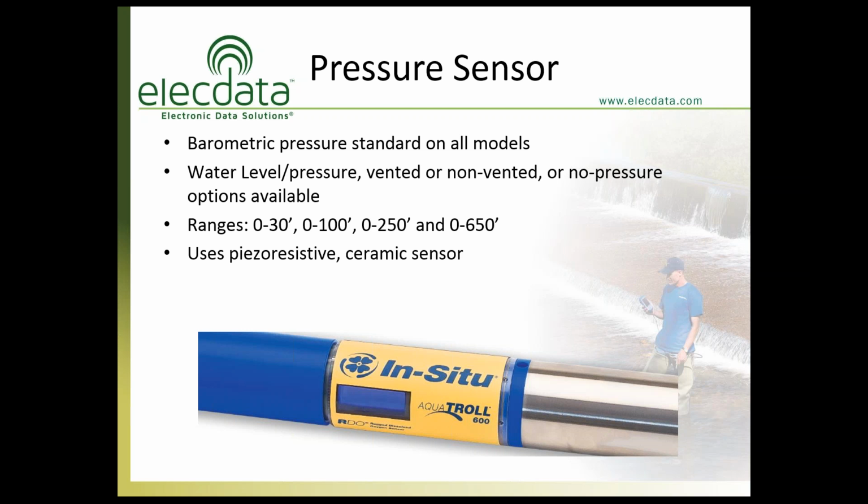Now I want to briefly elaborate on the advantages of having an internal barometric pressure sensor inside of the unit. I think there's 2 or 3 of them that are pretty important. One of them is that it automatically enters the barometric pressure during your dissolved oxygen calibrations. So as you're doing a DO calibration, you basically just start that running. As soon as the sensors have stabilized, it says, hey, I'm getting stable data now, I'm going to just go out and read my internal barometric pressure and use that for the calibration. Now, if for some reason you think you have a better barometric pressure sensor, you can use it. So you can input your own barometric pressure data if you like.